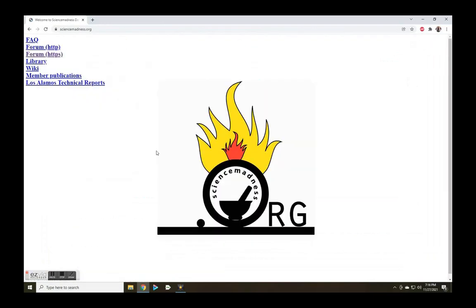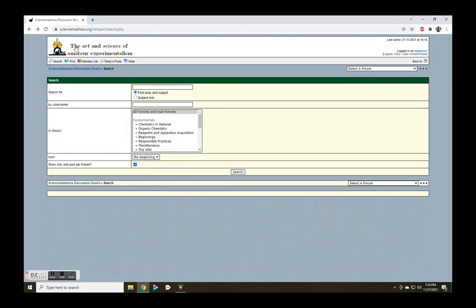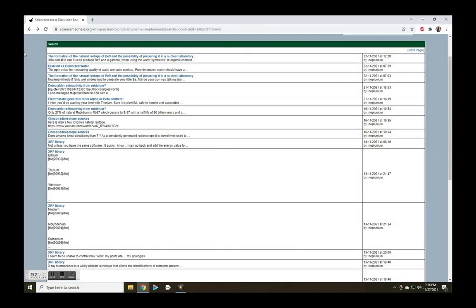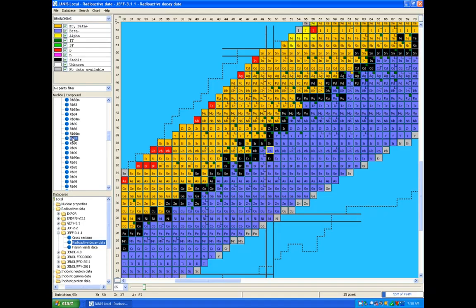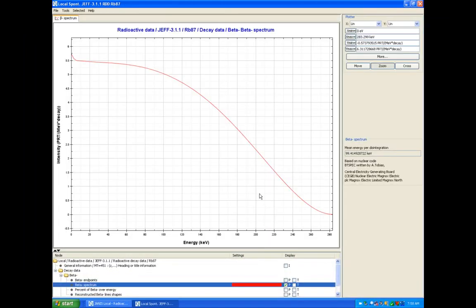sciencemadness.org. A recent topic in the radiochemistry section talked about detecting rubidium-87. This isotope makes up about 28% of our rubidium and is a beta emitter with a half-life of about 50 billion years.